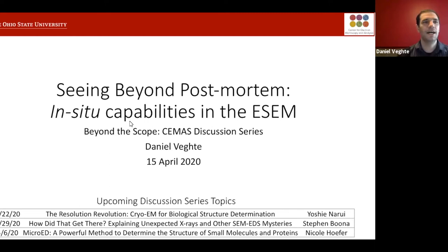So as Steve said, I'm going to be talking a little bit about ESEM capabilities today.